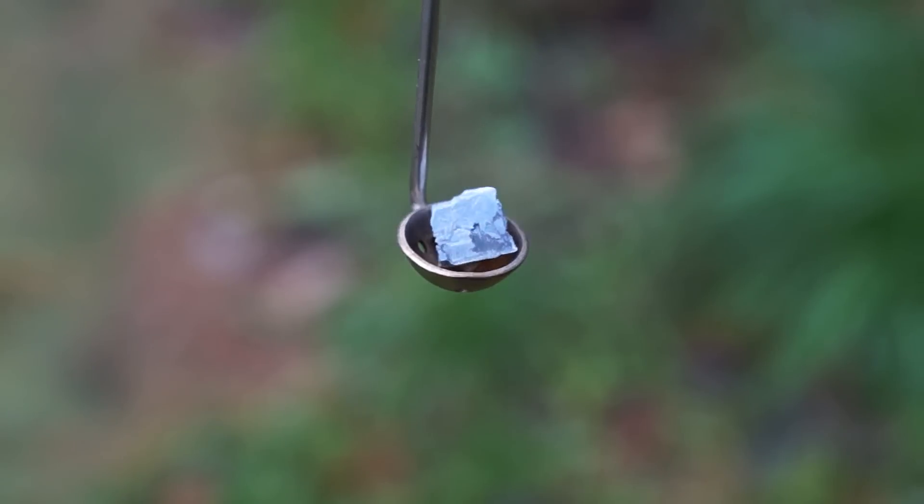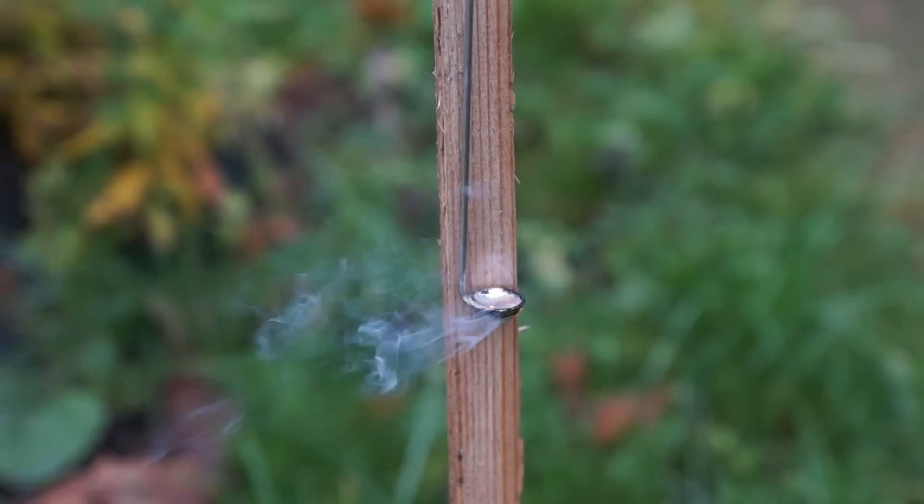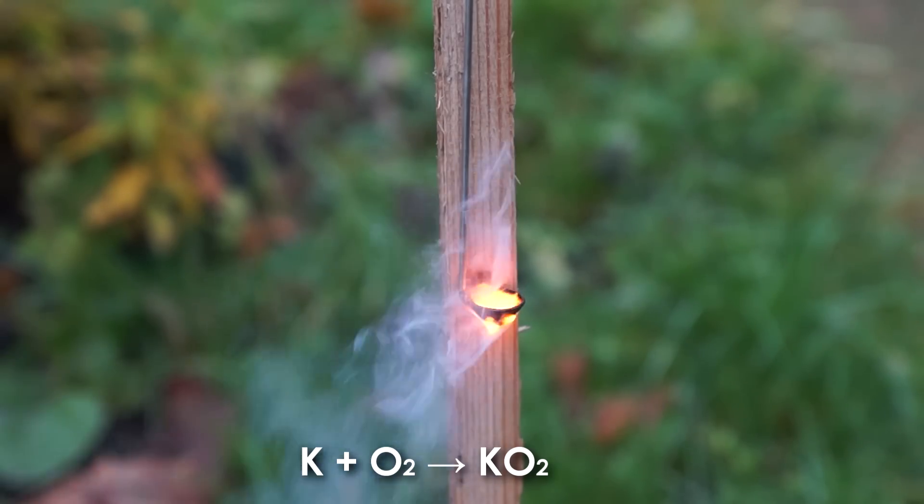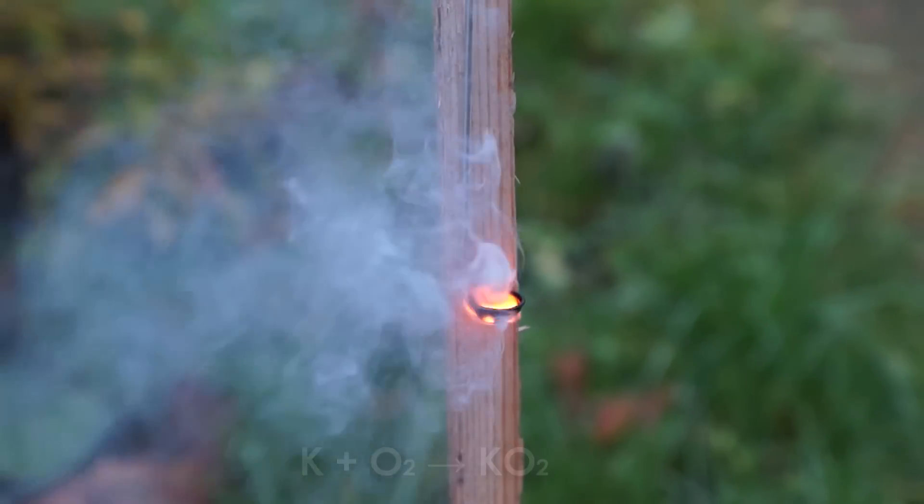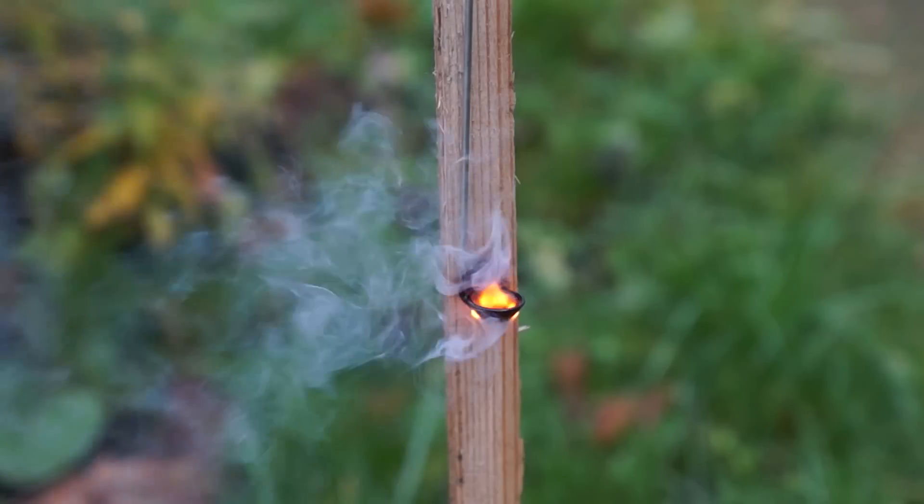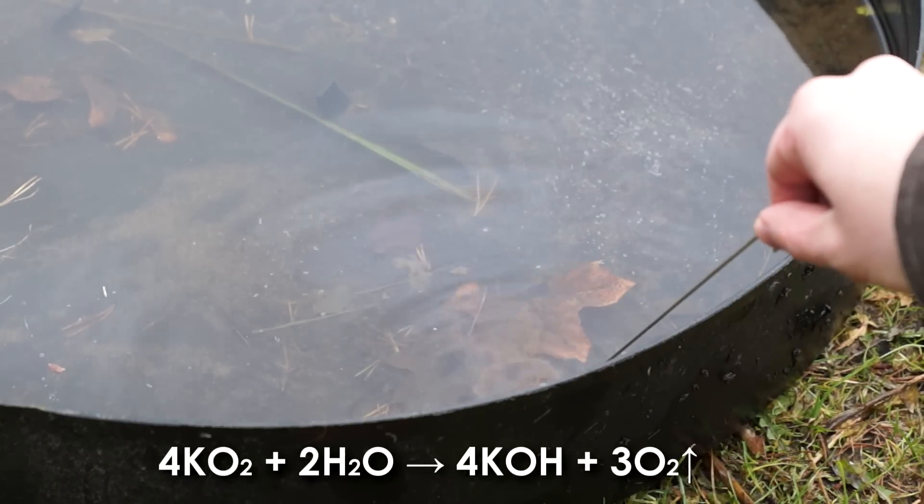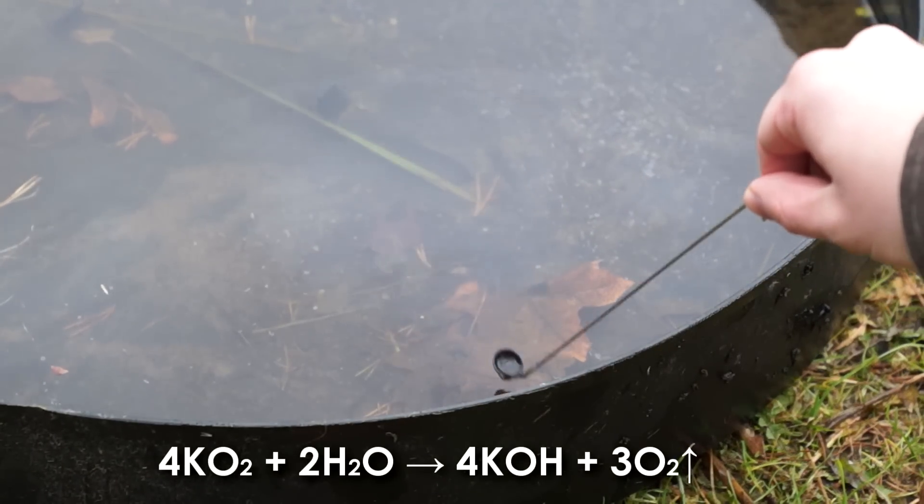Potassium can be set on fire. It will burn and form potassium superoxide. If potassium superoxide is dipped in water, it will begin to decompose.